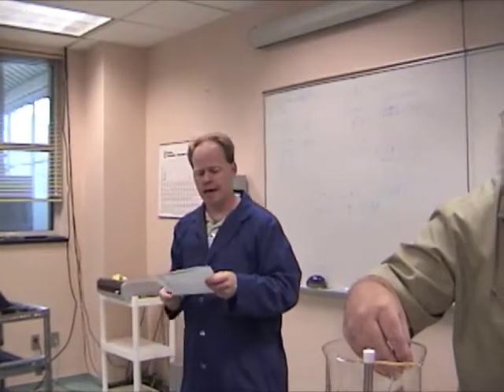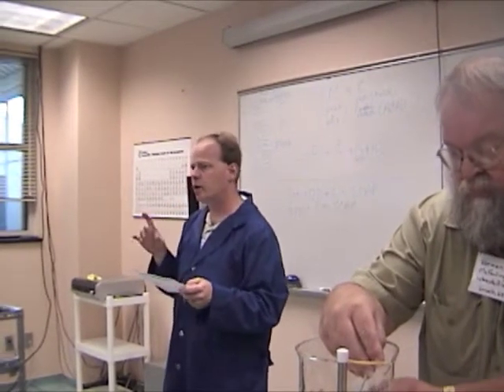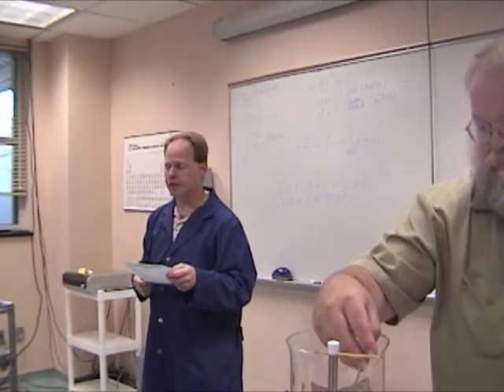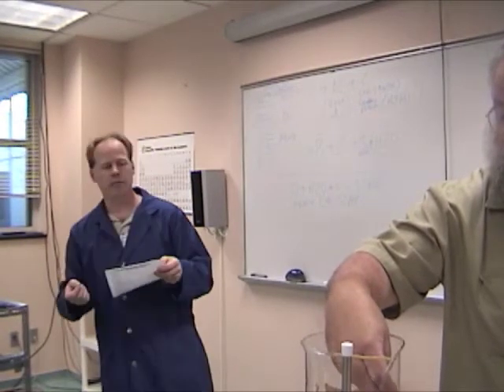So, 1 liter of oil, 200 milliliters of methanol. I'm going to play with KOH because it dissolves a little bit quicker in methanol. So I'm going to use 7 grams. If I was using sodium hydroxide, I'd use 5.5 grams. And then I'm going to make biodiesel with it.